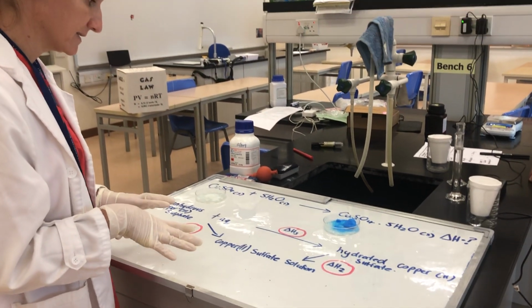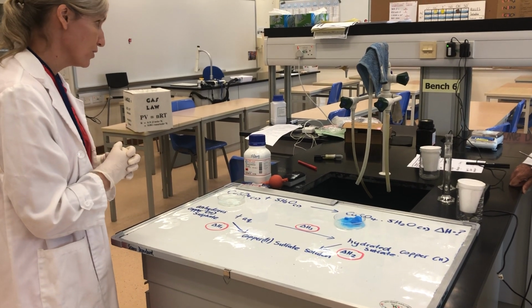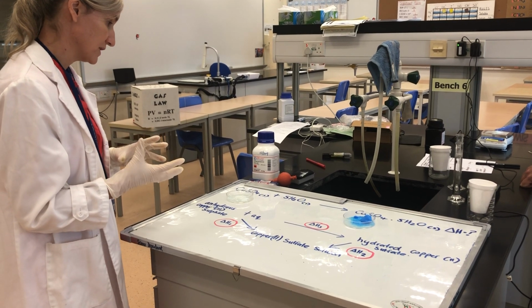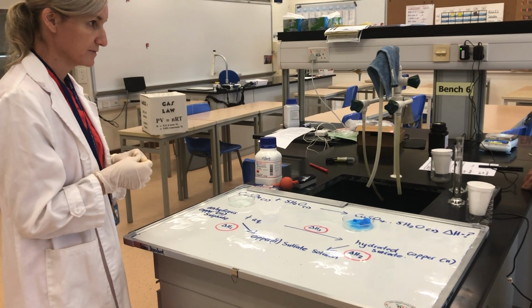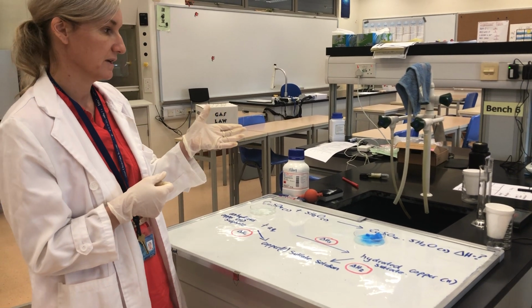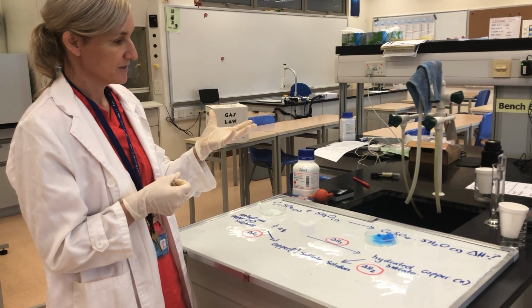And obviously with Hess's law, we have to think about if there are coefficients in our reaction or if we need to reverse it. I will take you through and show you how to do that once we perform the experiment, and Mr. Audie is going to be my lab assistant today and demonstrate to you how to use our Vernier DataQuest, basically our temperature device.